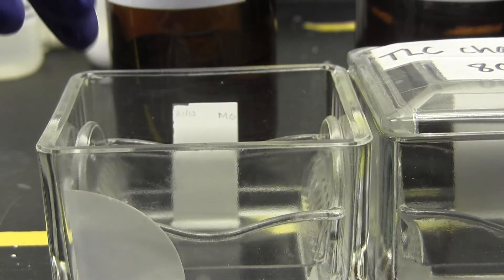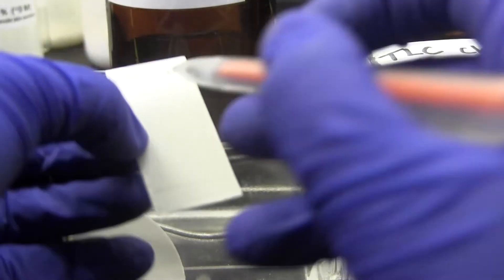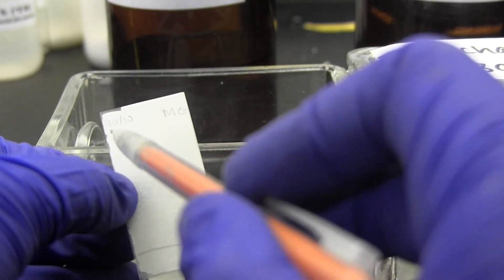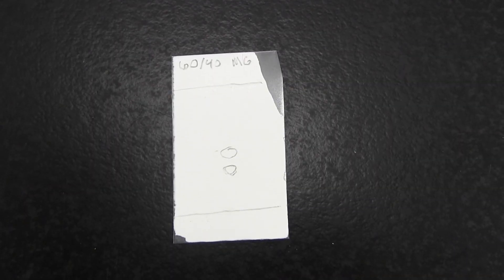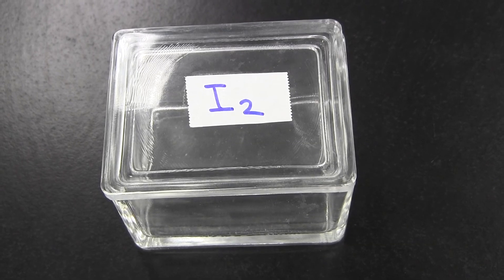Then, quickly remove your plate and draw a line using a pencil to mark the point that the solvent reached. Let the plate dry, then check it again under the UV light. Using a pencil, circle the visible dots. If you can't see your dots, use the I2 chamber.